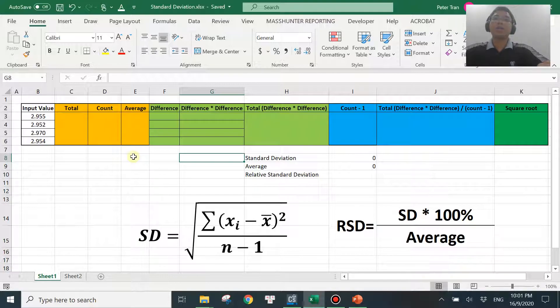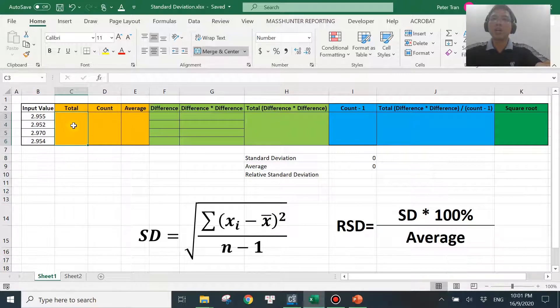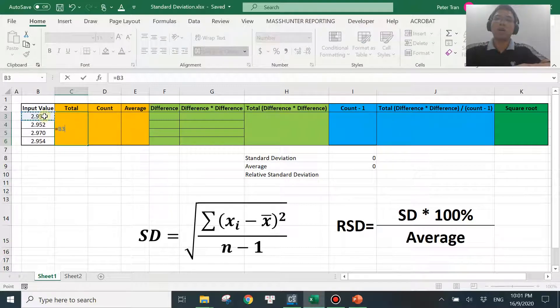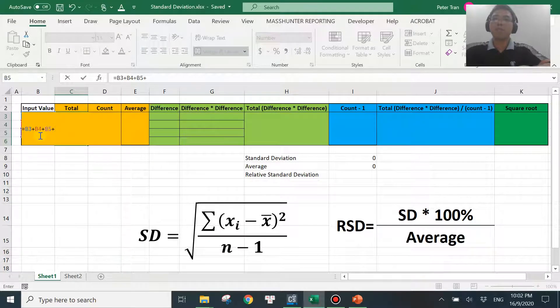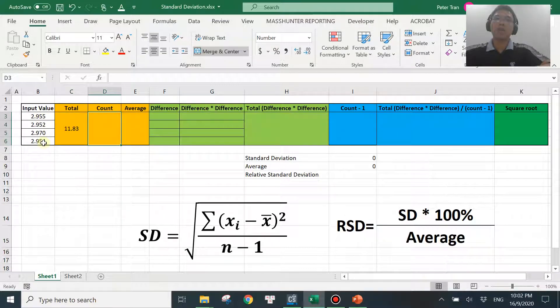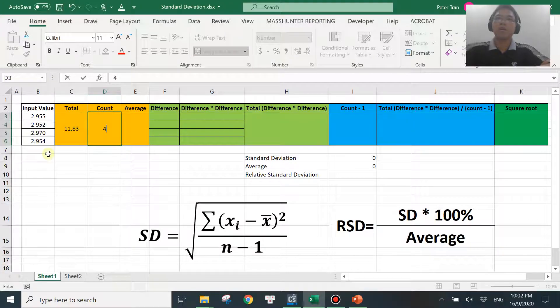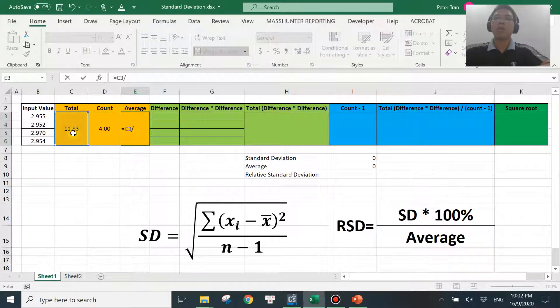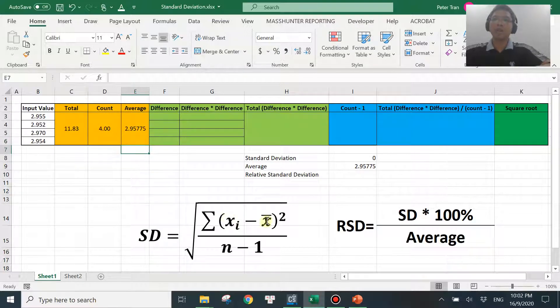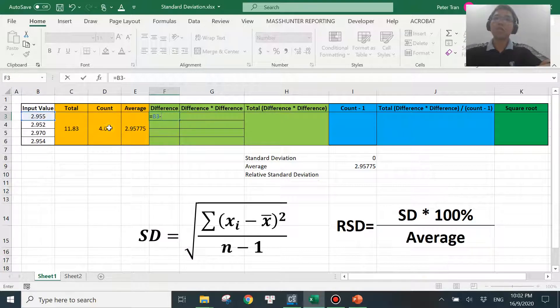Let's get into the manual calculation. If you look at this formula, the first item we need to calculate is the average of all individual values. To come up with that you need the total of all input values — this one plus this one plus this one plus B6. Then count is how many numbers you have: one, two, three, four. Average is basically the total divided by count. There you have the average value. The next step is to calculate the difference between each individual value and the average — input value minus average.